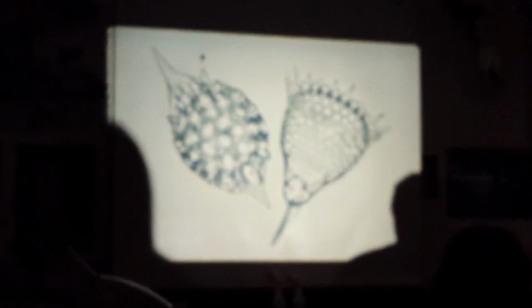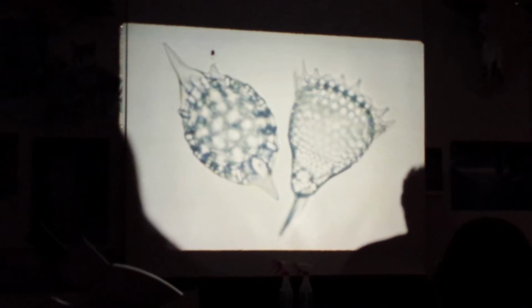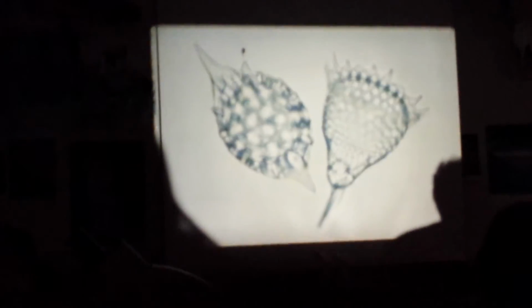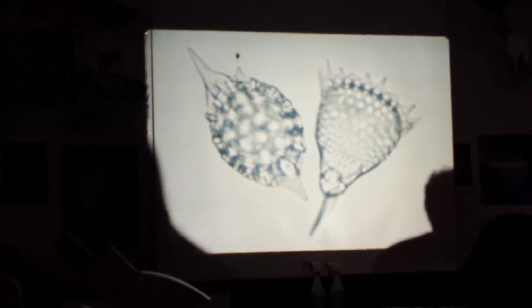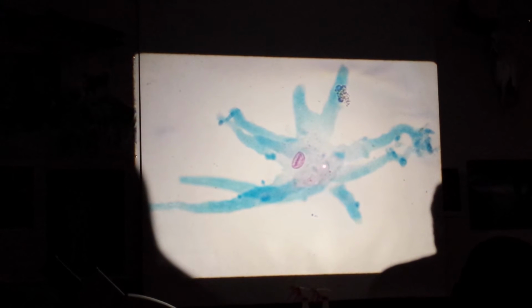Radiolarians, more of those Rhizaria amoebas, but this is a different pseudophylum, Radiolaria. Looks like little glass snail shells in this case. Green algae, Chlorophyta, Desmids, little colony. Another amoeba. This one you can see a contractile vacuole right there.